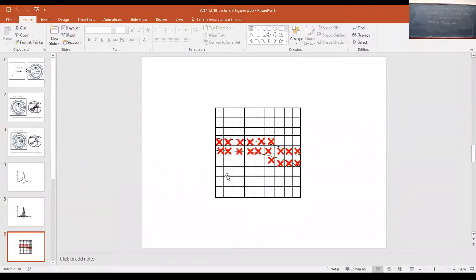So the first, here's just a grid of pixel values. This is just like a small piece of a detector. And what you would do is you draw a bound in 2 theta, so just a bounded region on a ring. And you'd grab the intensity on each pixel that falls within your angular bounds and sum those all together to azimuthally integrate. So that's a simple strategy.